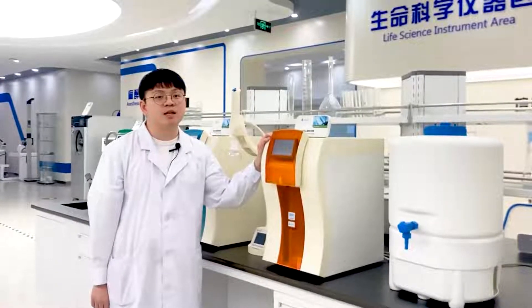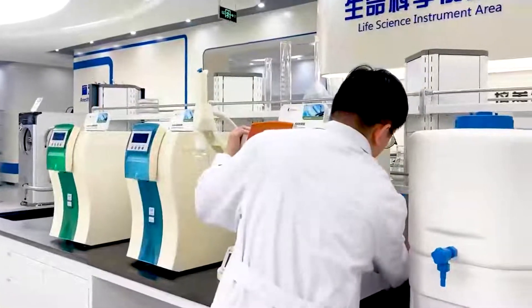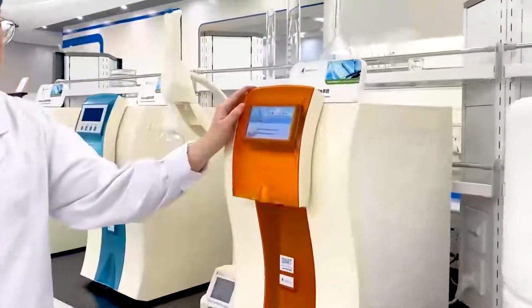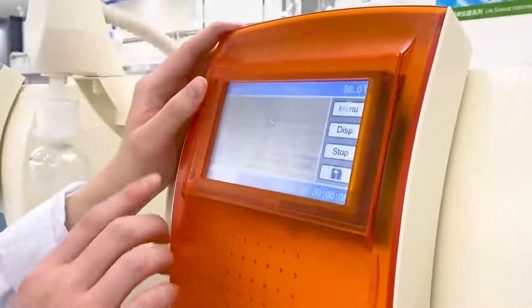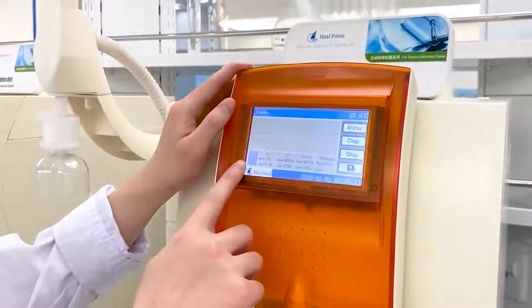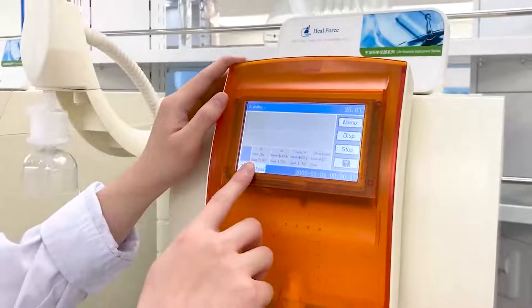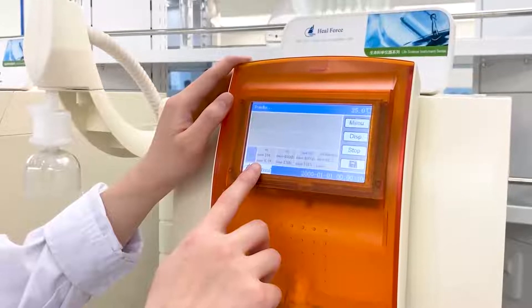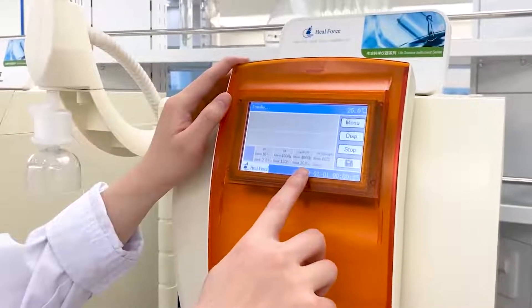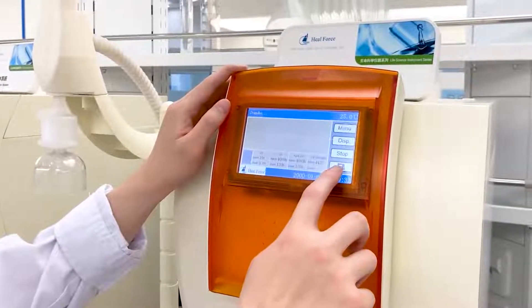Now we will focus on our Smart Plus series. This is our Smart Plus — let me turn it on. This is the standby state display. You can see the water temperature, water tank status, alarm status, pre-treatment cartridge status, ultra filter, tank UV, and UV strength — the UV inside the main unit.